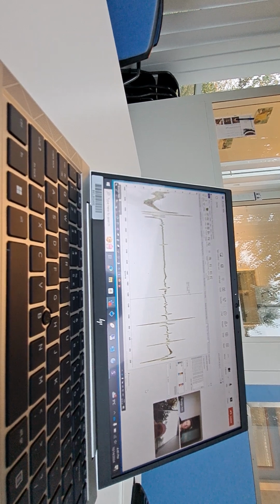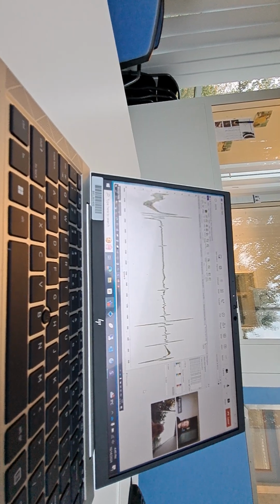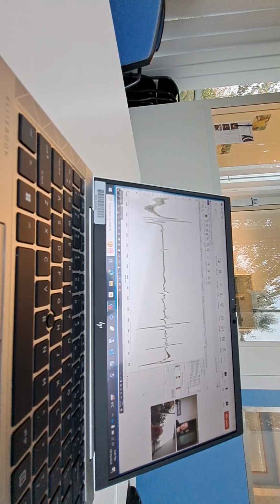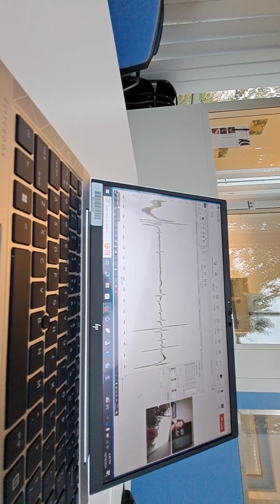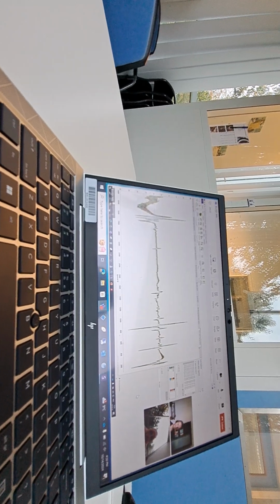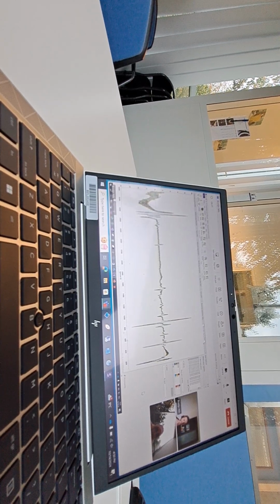So I would use just the SNV alone, and then the first derivative plus the SNV. But sometimes, if it's not needed, go as simple as possible. So if you see on a SNV your peak shift or the peak of your free base, it's sufficient. It's not always needed to do a derivative.